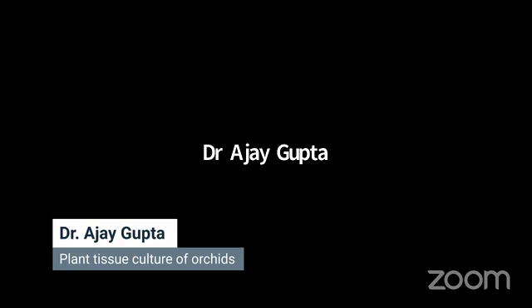In this case, the lab is planned that way. There are three major steps for tissue culture. One is a mother plant, which is called the explant. We obtain it from the area where they grow in a natural habitat.